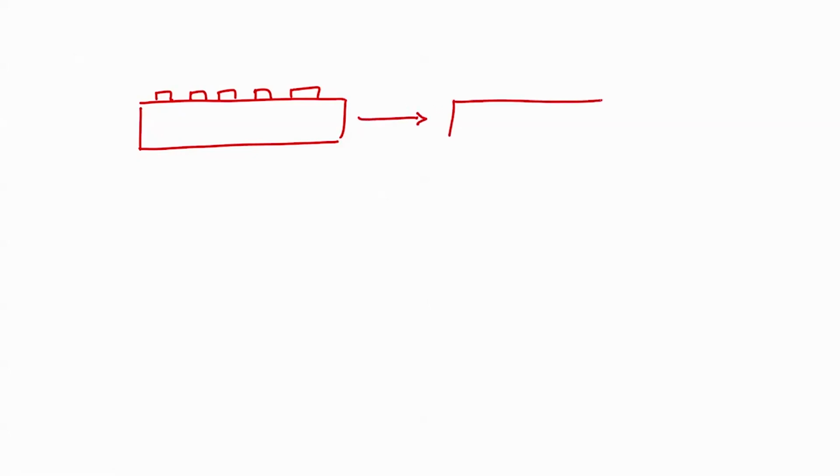So, how to create this kind of chip? Like I said, if you have a plastic substrate, you screen print a heater on one side of the substrate and then you reverse the substrate.